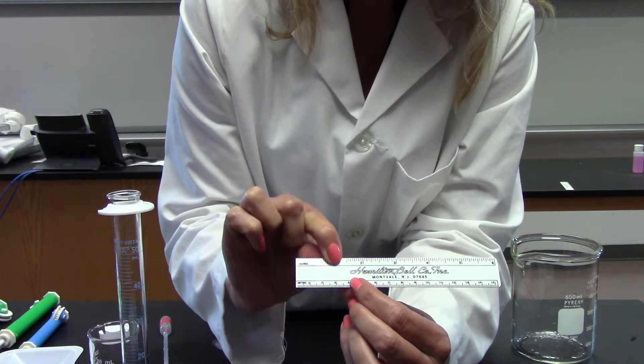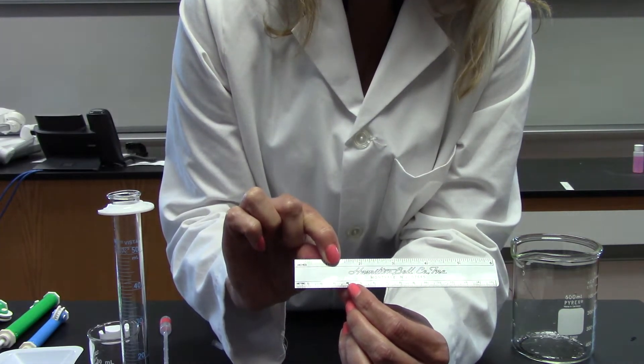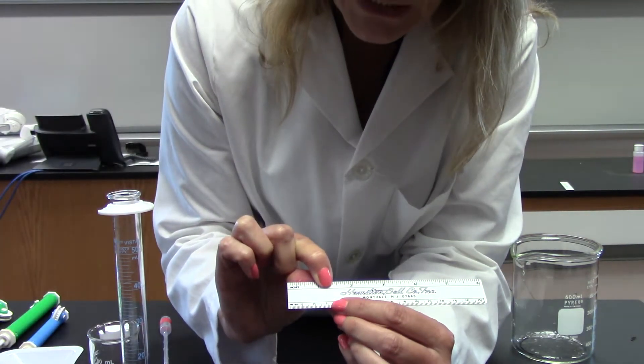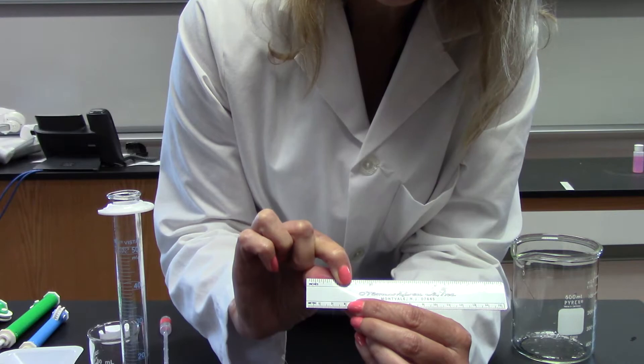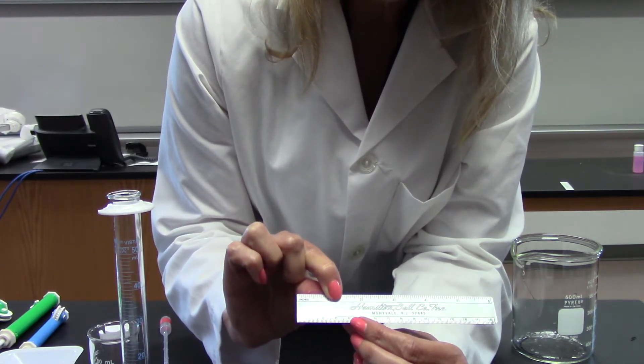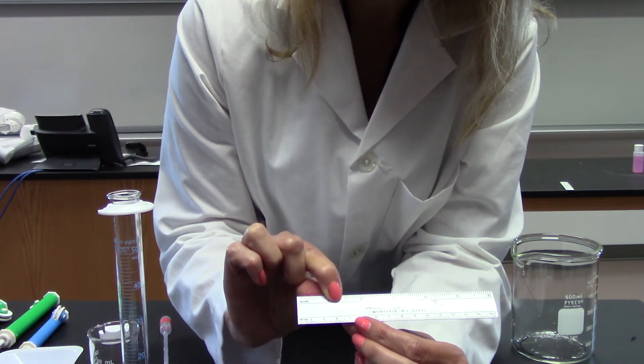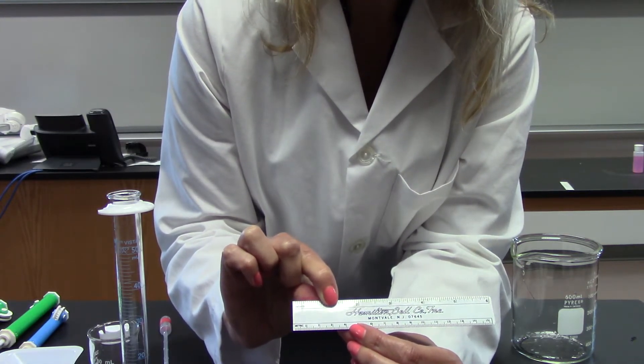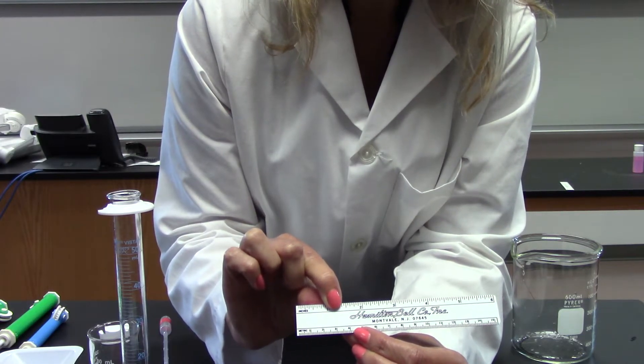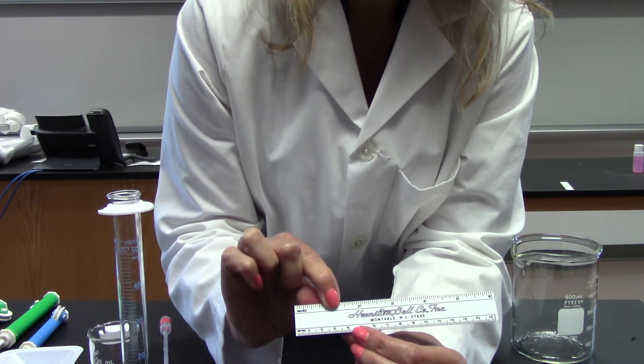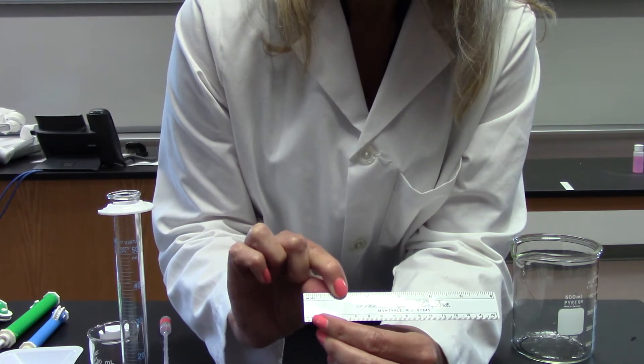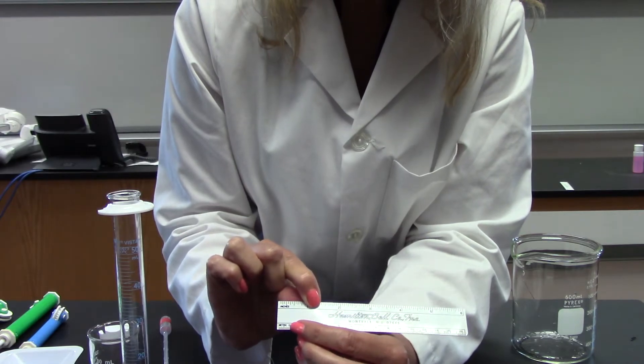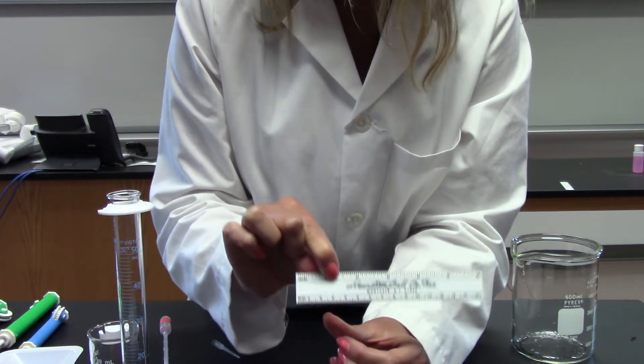So if you told your instructor that you measured 4.2 millimeters, that would be very unlikely. You couldn't measure tenths of a millimeter with the naked eye using this ruler. If you're saying 4.2, I'm assuming that was actually 42 millimeters. And I'm sorry if I said milliliters when I was just explaining that - it's millimeters. So meters are length, and we're measuring centimeters or millimeters with this ruler.